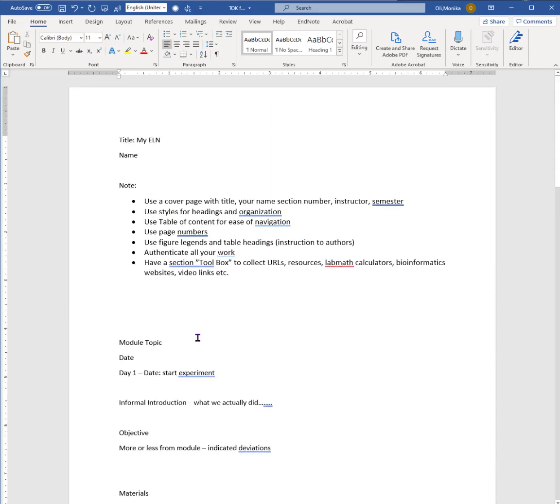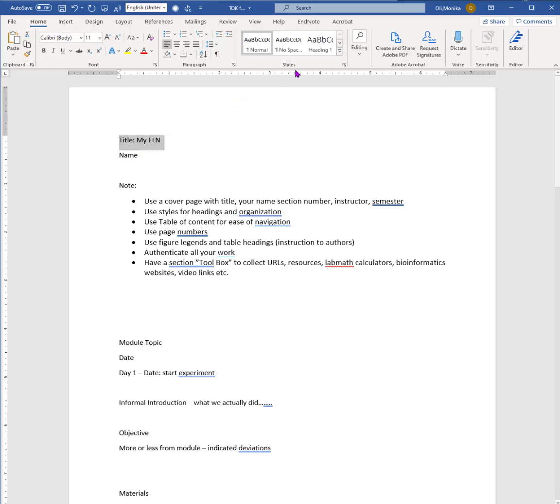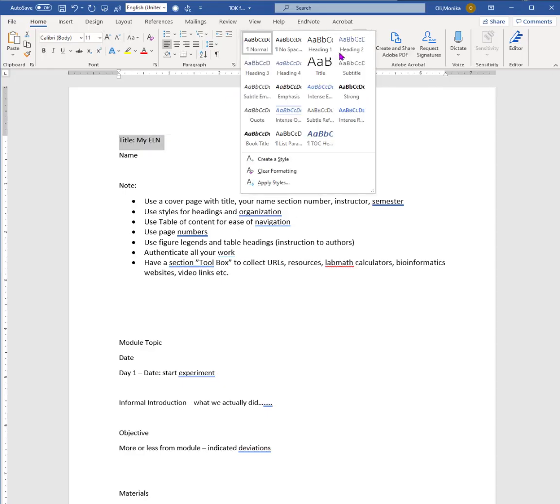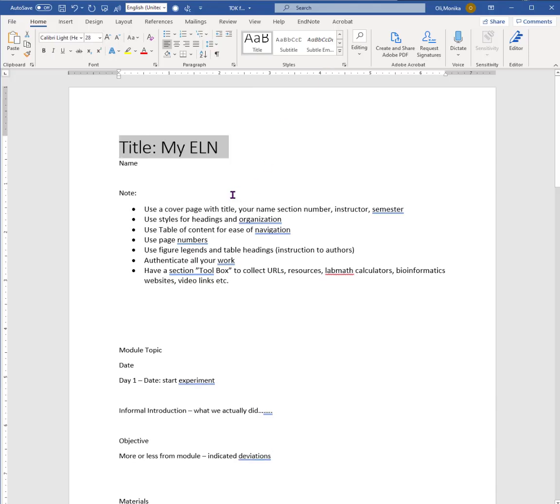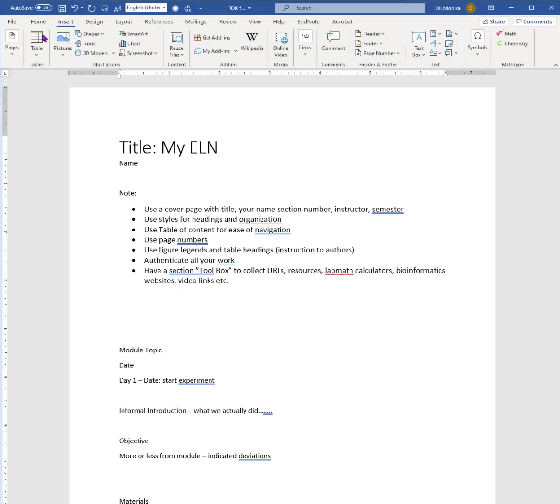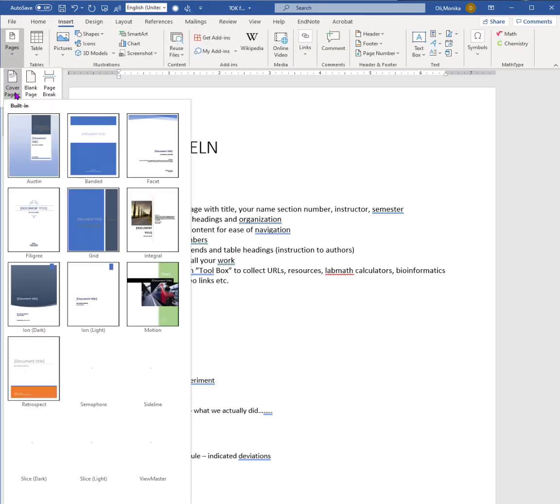Let's see if we can move that into something a little bit more interesting. Title would be definitely using styles - that would be a title, the main heading of your ELN. And it says here use cover page. How do you get a cover page? You go to Insert, then you go to Pages, and you say Cover Page.